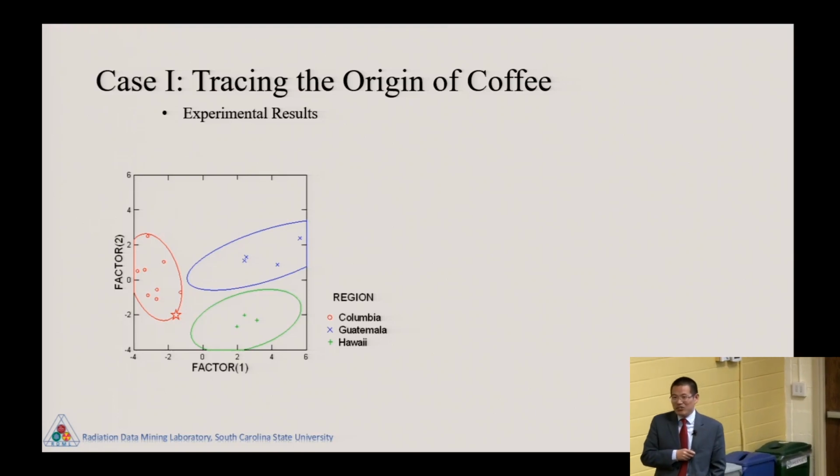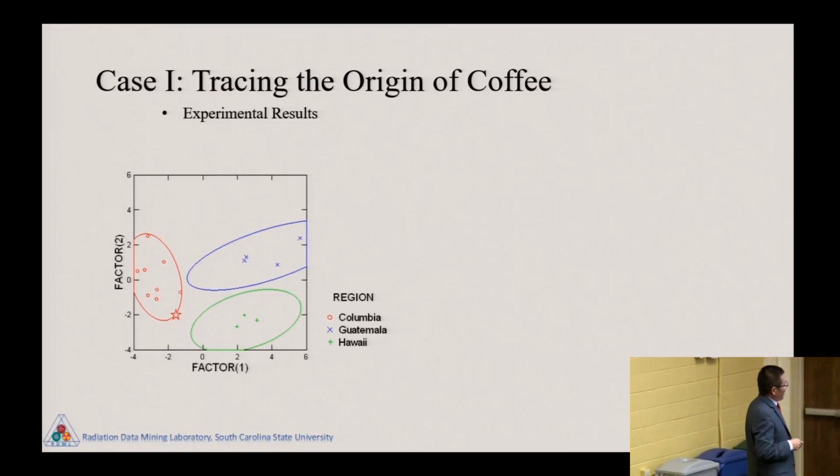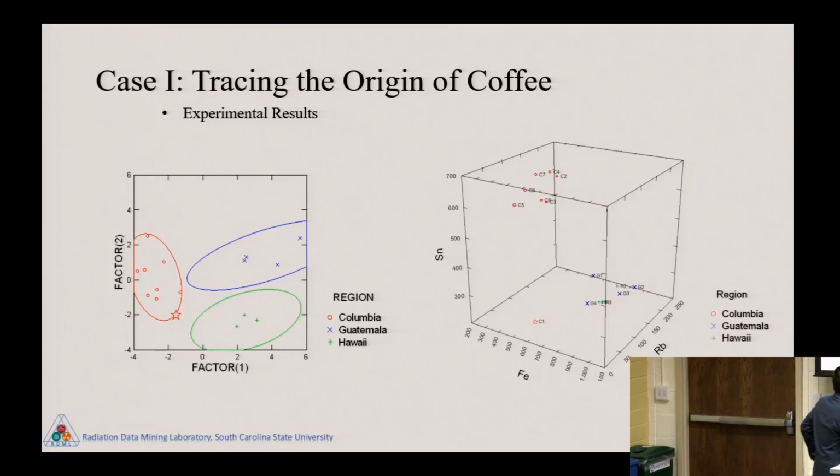I got it from the local market, and they said it comes from Colombia. The other sample I know comes from Colombia because I got it from a professor from Colombia, and they got it from the farm. But this one is questionable, and so it's right at the edge. In this analysis, it's at the edge, but look here. I have another thing.